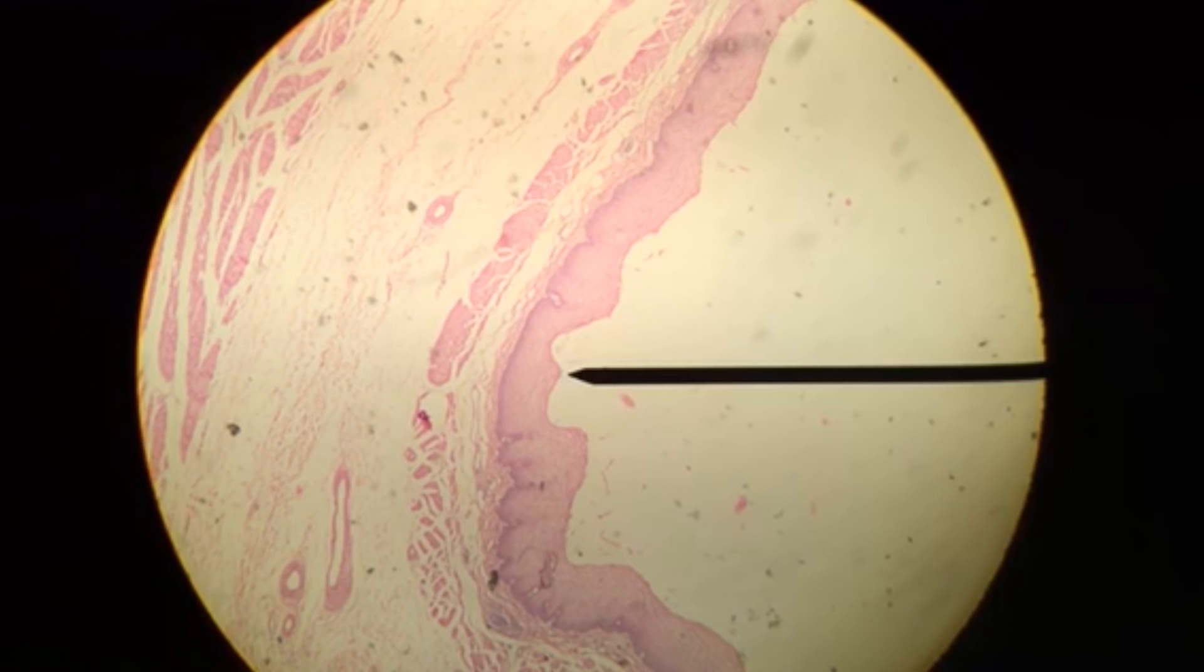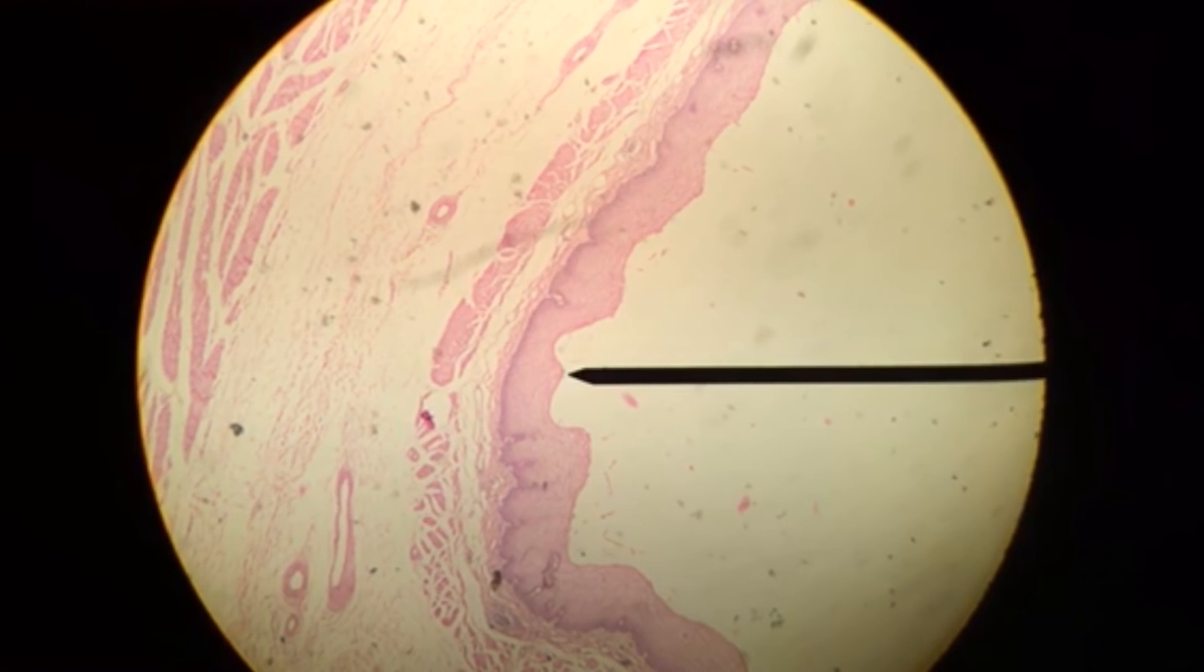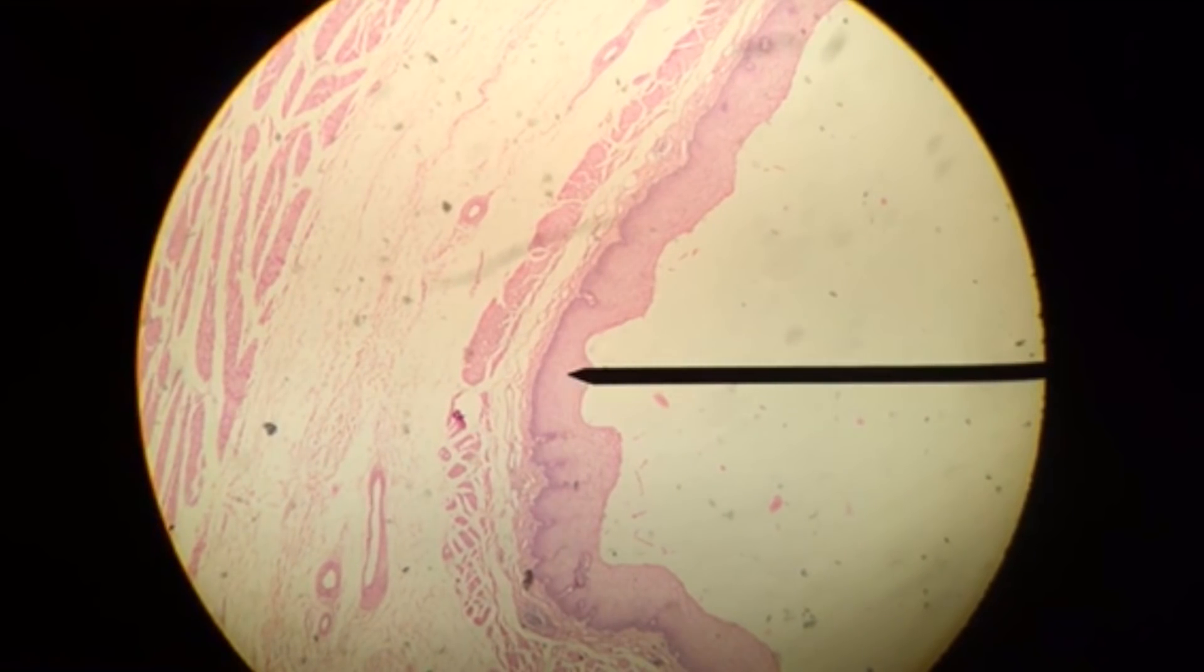This is the esophagus. We're going to work through the histology. We're going to start at the lumen, which the pointer is in now, which is the space at which the bolus of food will travel through, and work our way to the abdominal cavity.